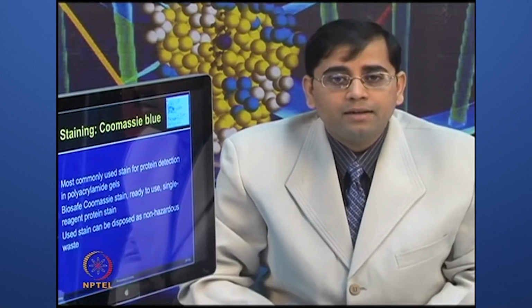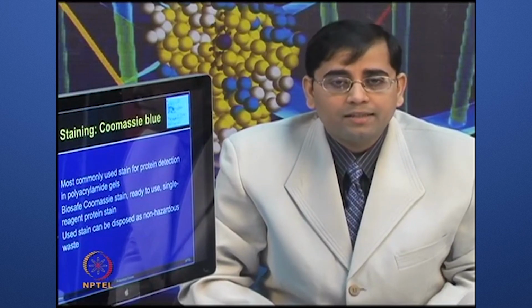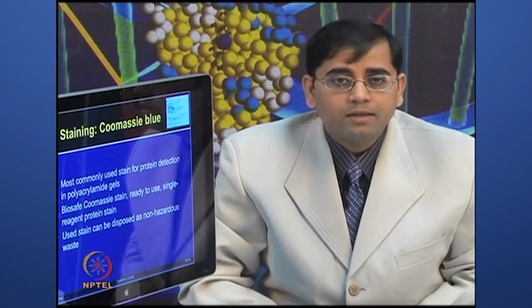Now, there are some advanced forms of Coomassie stains being developed, including BioSafe Coomassie stain, which is non-hazardous, made keeping in mind the environmental scenario. So, it can be disposed of as non-hazardous waste.